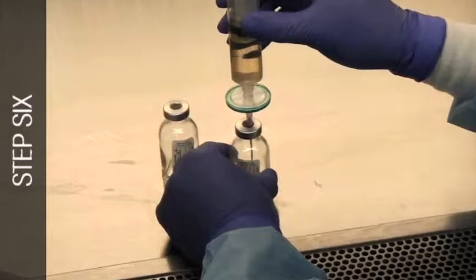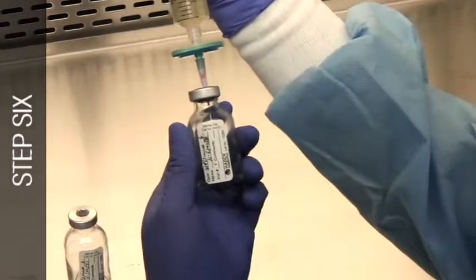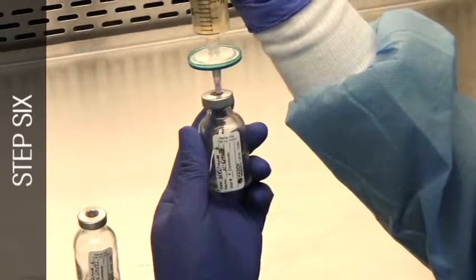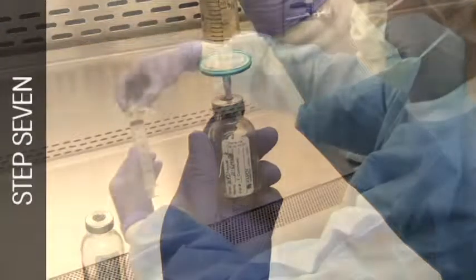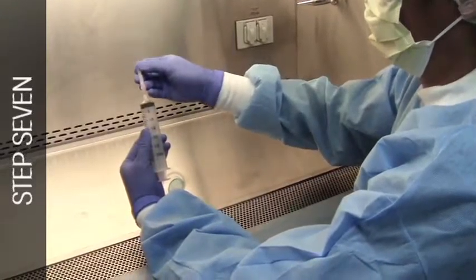Inject 10 ml from the syringe into the vial labeled 1. Inject another 10 ml into the vial labeled 2. Aseptically remove the filter unit and needle, then return the needle to the syringe.